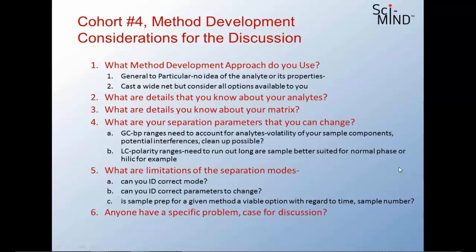That is critical, because there are some things you can do with GC. Nick emphasized a lot of GC work. But for example, for really high boiling point analytes, GC would be a very difficult option. So you really have to rely on LC techniques.